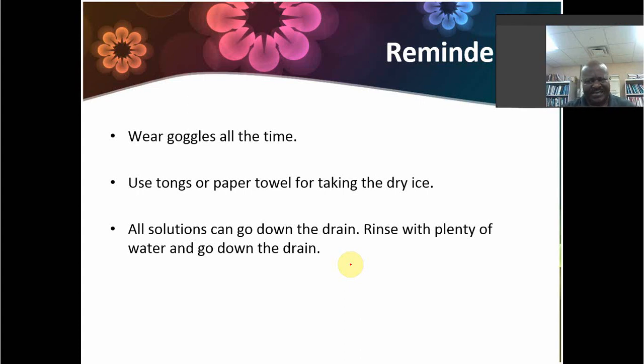Short, mind-provoking. You guys will do most of the reasoning and not many calculations. Most of what you need to do in the lab, talk it out. You can learn a lot from interacting with others, discussing things, never copying. So it goes something like this. Hey, what's the effect of concentration? And Mr. J says, well, we're adding more, so the concentration is increasing and the conductivity is increasing. And so you discuss it and come to some agreement, but then everybody writes their own answer.